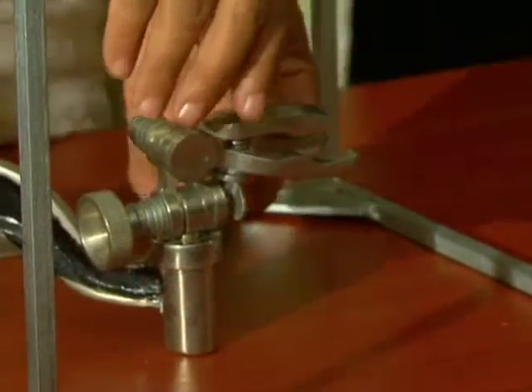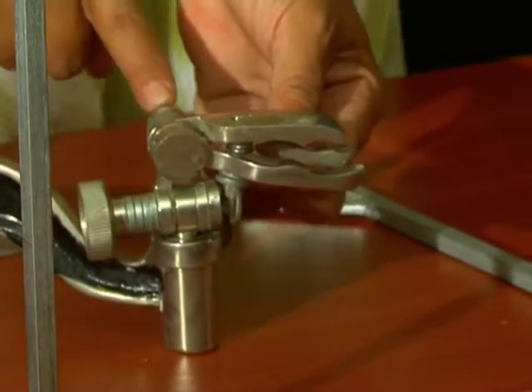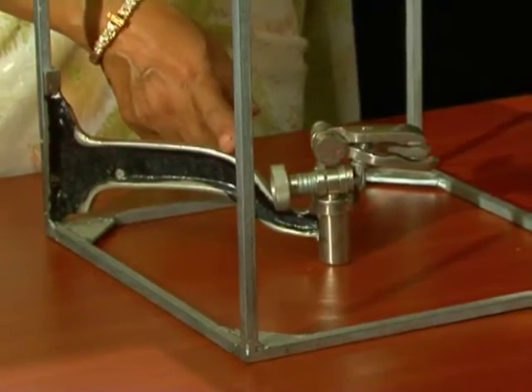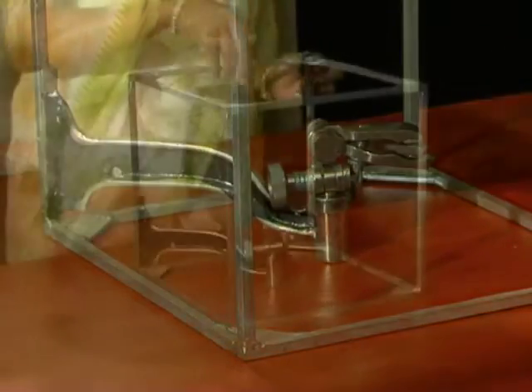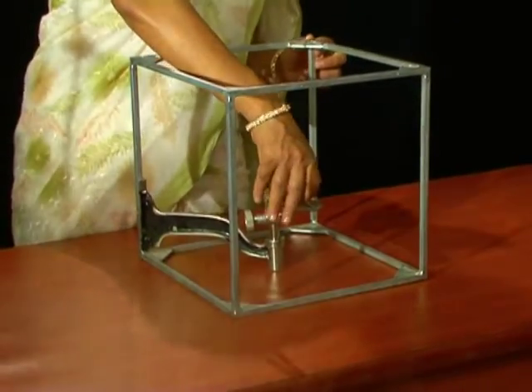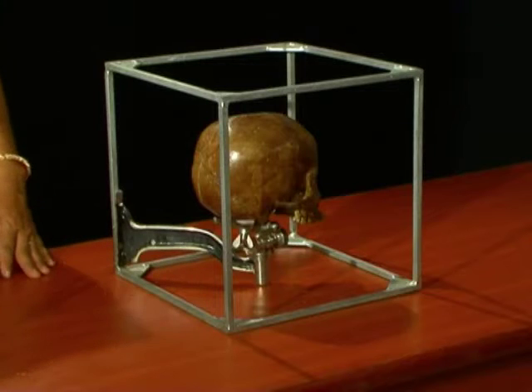A jaw-like structure for holding the skull is fixed in the center of the cube by means of an extended arm on one side of the height. To the jaw-like structure, the skull to be measured or the drawings to be done is fitted at its foramen magnum, and thus the skull remains within the cube.